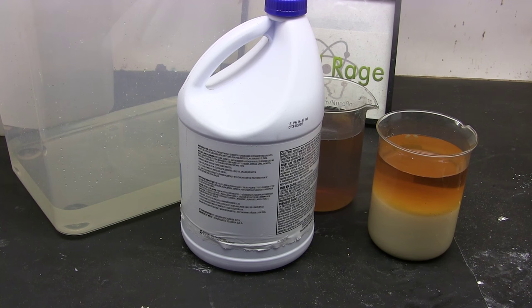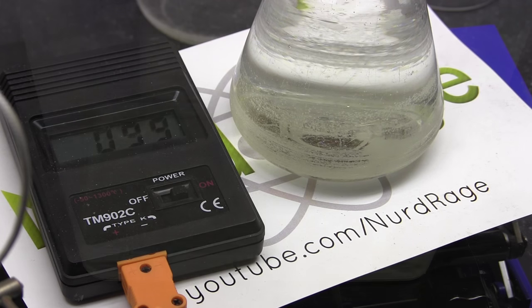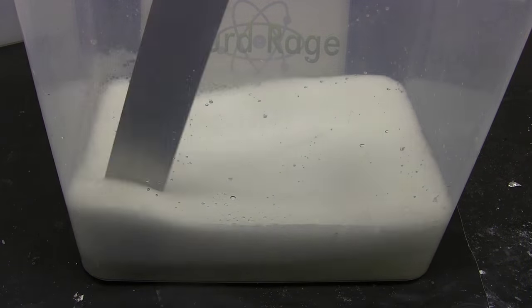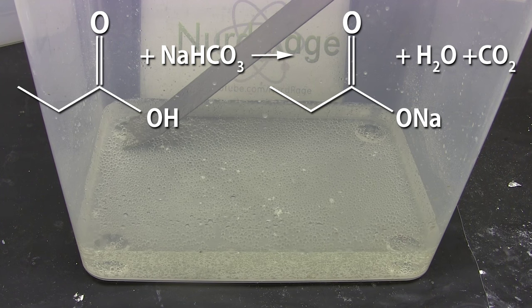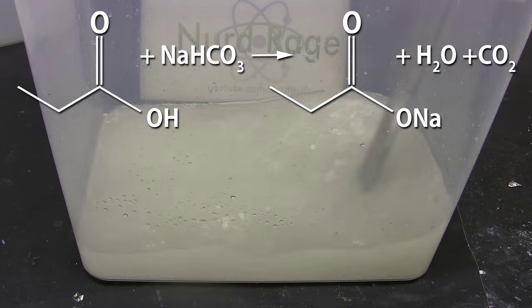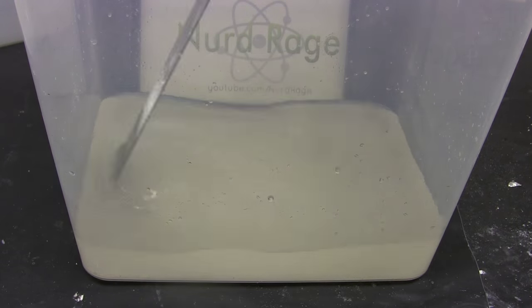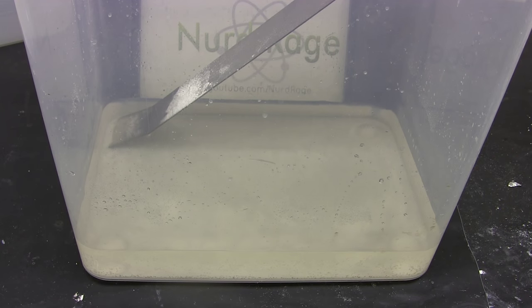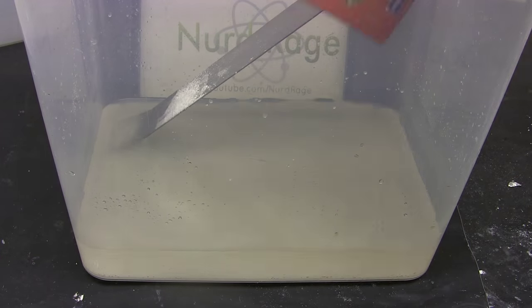Anyway, we now have to separate the water from the propionic acid. We can't just distill it since it forms an azeotrope. So we're going to go a roundabout way and add sodium bicarbonate to react with the propionic acid and convert it back into sodium propionate. Since we don't know exactly how much there is we'll have to crudely titrate by adding small amounts of sodium bicarbonate and stopping it when it no longer fizzes. At this point all the acids have reacted.